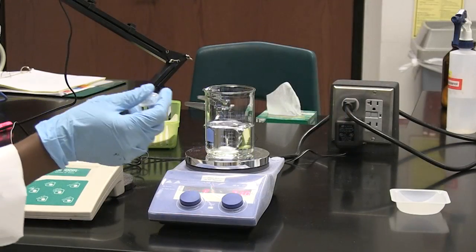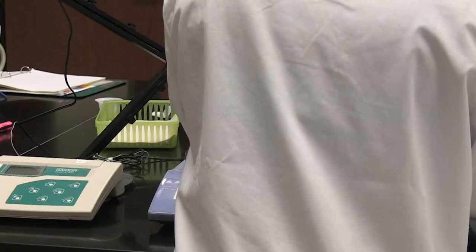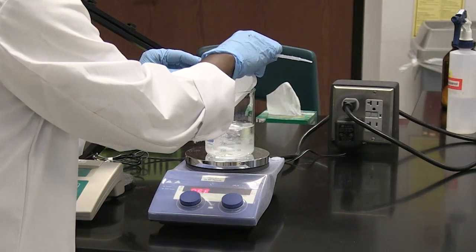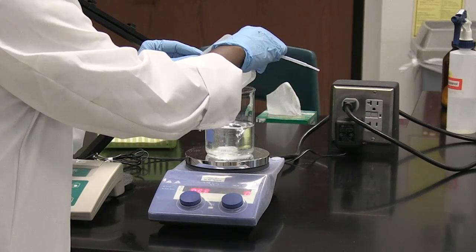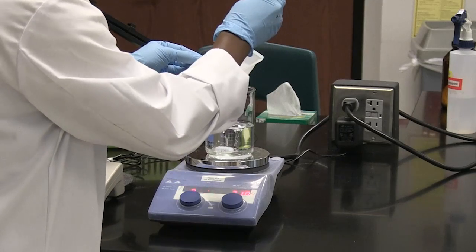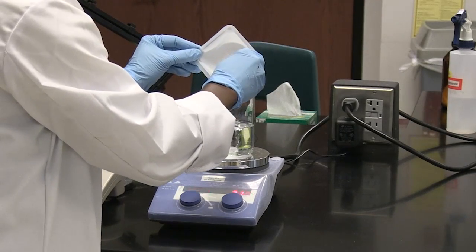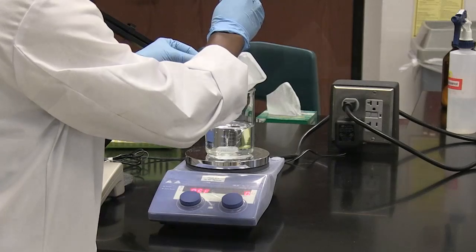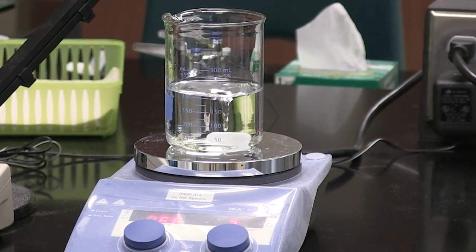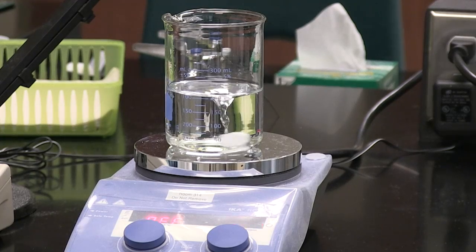And I'm going to do the same thing with my sodium chloride. This is my sodium chloride that I'm going to add. Some of the crystals are left in the weigh boat, so I'll rinse those out as well.